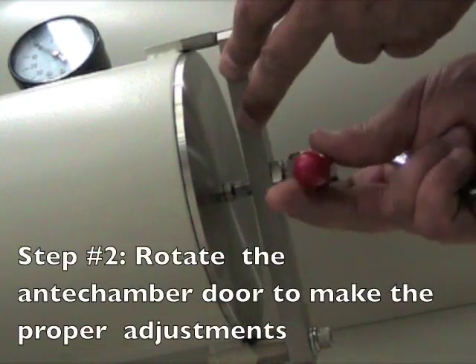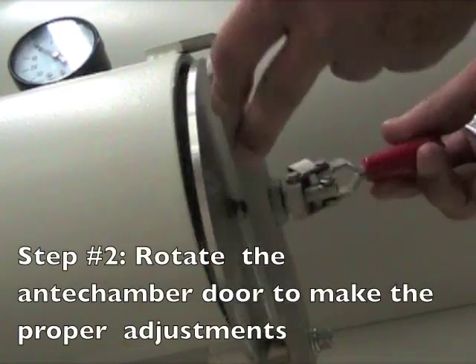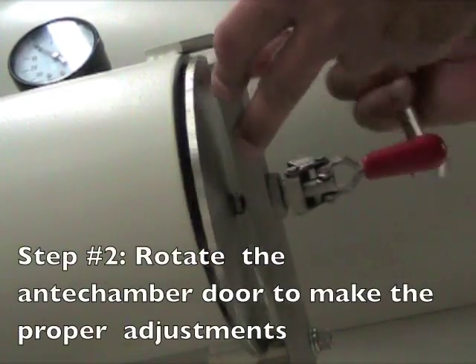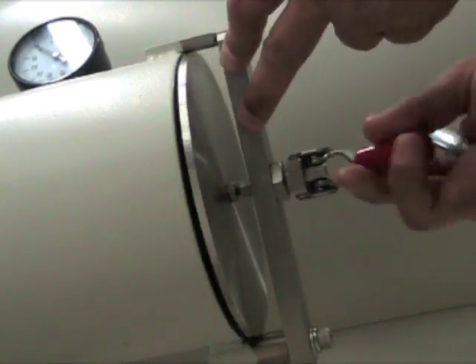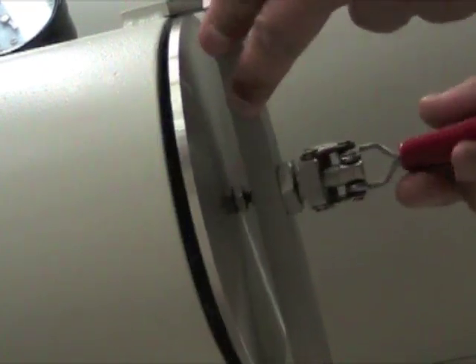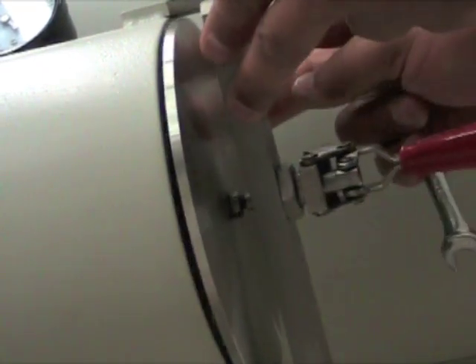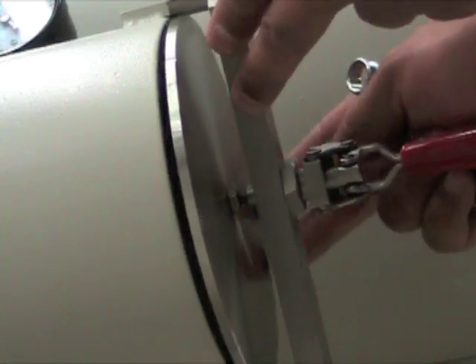And once again, we need to find the ideal spot where the anti-chamber door closes correctly so that we can successfully pull vacuum on this anti-chamber without compromising the volume inside of it by pulling in oxygen. So once again, clockwise increases the closing tension.